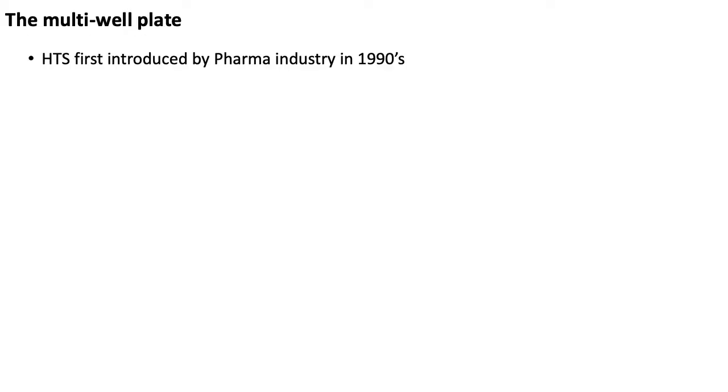Now looking at the multi-well plate. High throughput screening was first introduced by the pharma industry in the 1990s. And the first plate that was used was the 384 well plate, and that was made by Dr. G. Lennon in 1992.